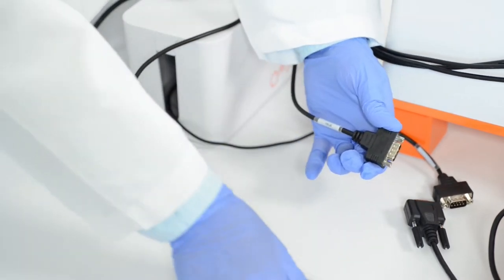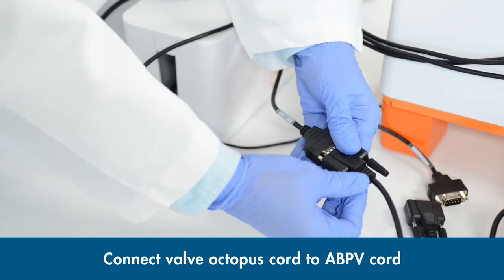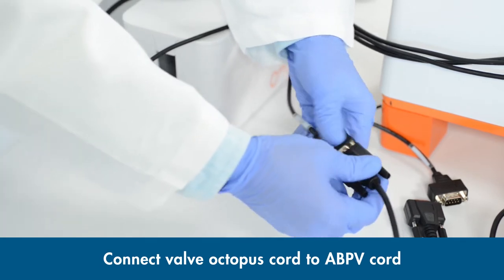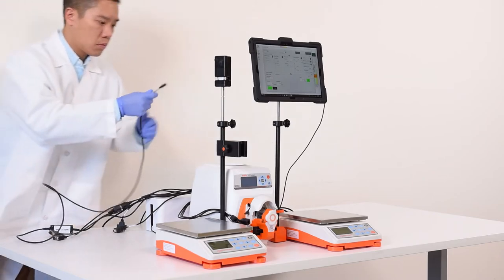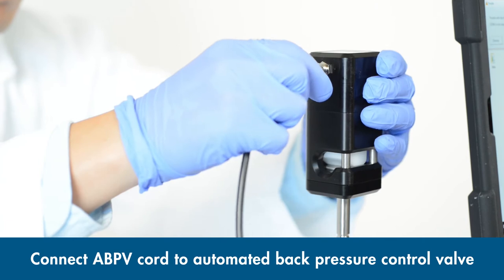With the power off, connect the automatic back pressure valve or ABPV cord to the valve connection on the KFCOM octopus cable. Complete the connection by plugging the other end of the cable to the ABPV.